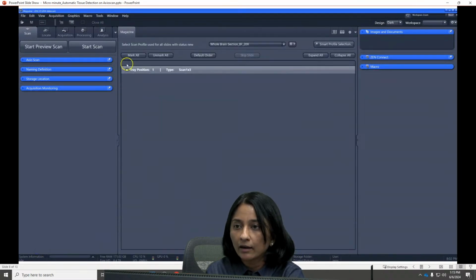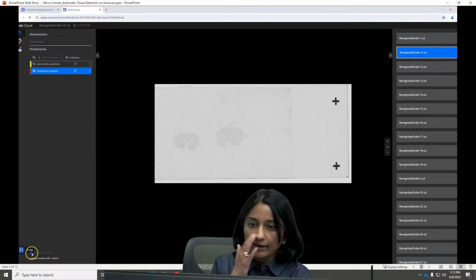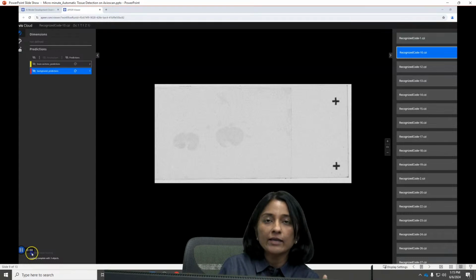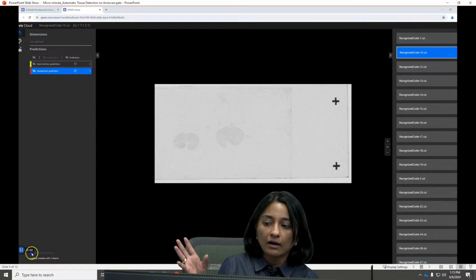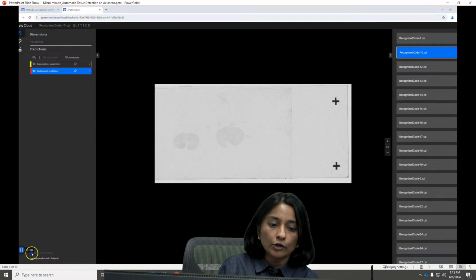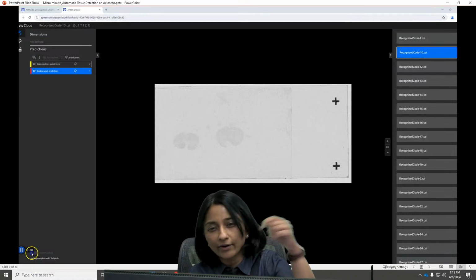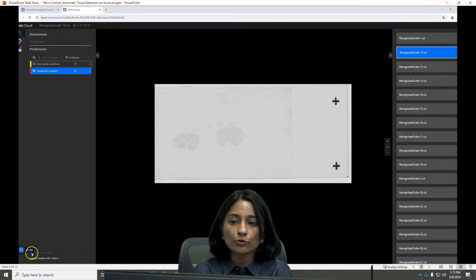So let's look at another example of me looking at fluorescent sections. In this case, these are slides that are very faint. As you can see, these are fluorescent sections that are not stained with any dye. Again, very difficult to scan unless you try to adjust the histogram and try to squint your eye and try to draw them out, or do a DAPI preview scan, or use a Sharpie, and so on and so forth.